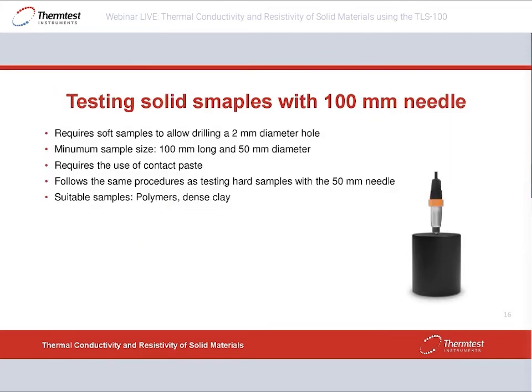We can also use the 100mm needle for testing other types of dense solid samples, but they need to be a bit soft, because then you're actually able to drill this 2mm diameter hole. Now we need to have a longer sample, 100mm long, the diameter still 50mm, and then you can use the 100mm needle. Still requires the use of the contact paste, and you follow basically the same procedure as we discussed before for the 50mm needle.